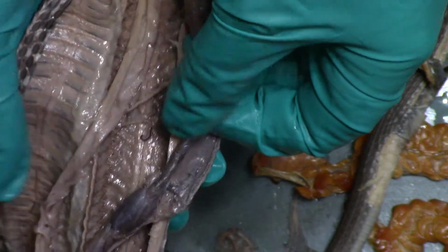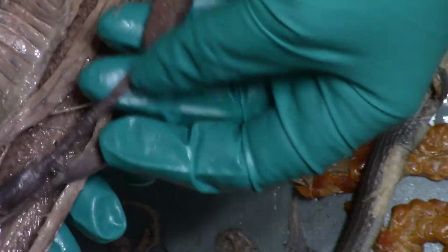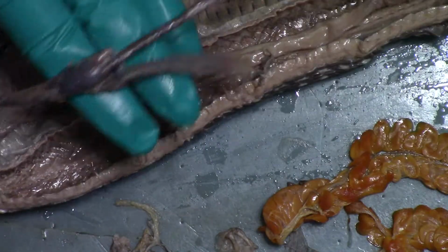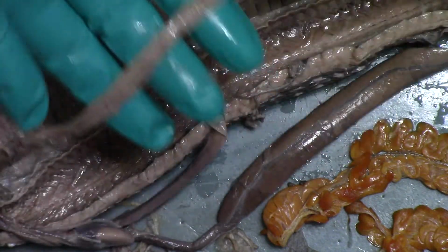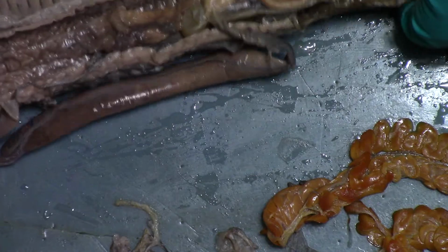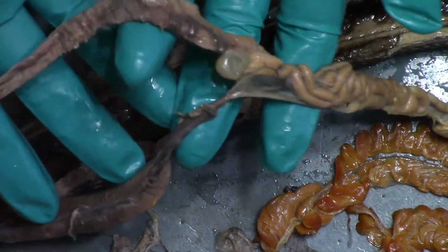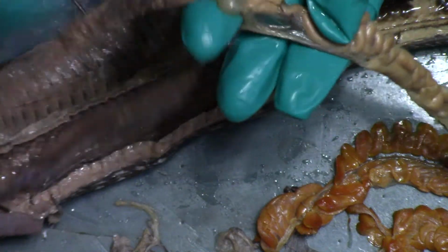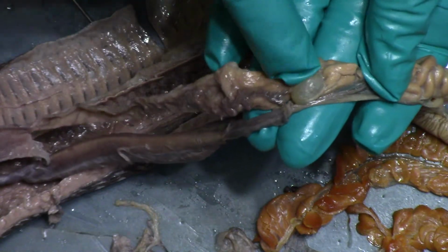There's the heart, the giant vena cava vein, and then here's the liver. It's pretty big, pretty easy to spot. And then on this end, when we follow the heart and liver in one hand, and the esophagus in the other hand, they kind of meet at the stomach area. So here's the esophagus leading into the stomach, and then right where the liver connects to that alimentary system, we have the gallbladder, which is green.